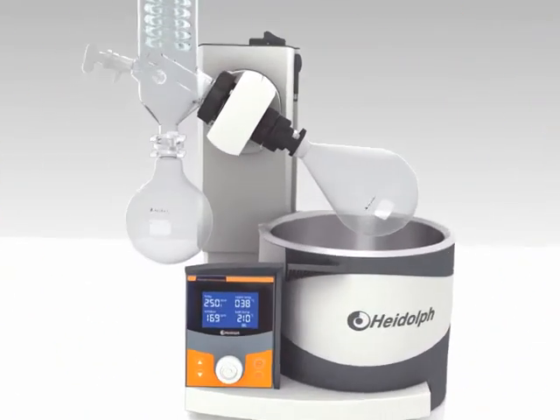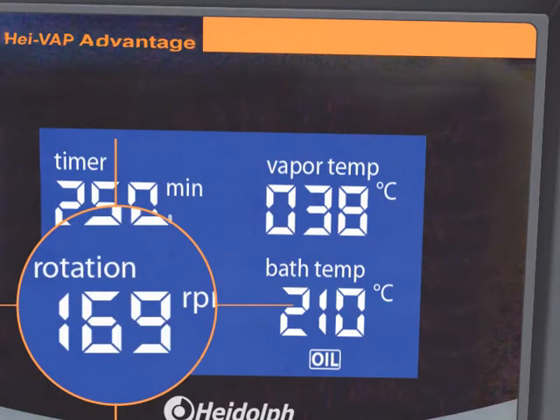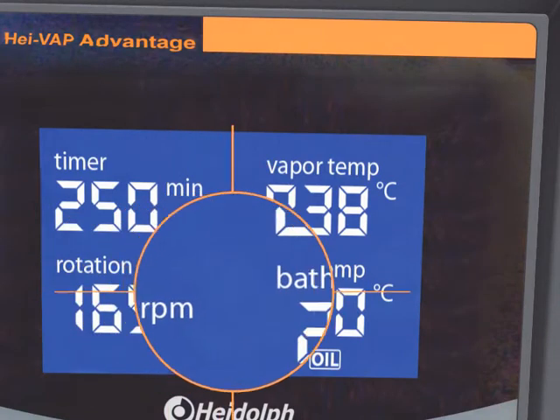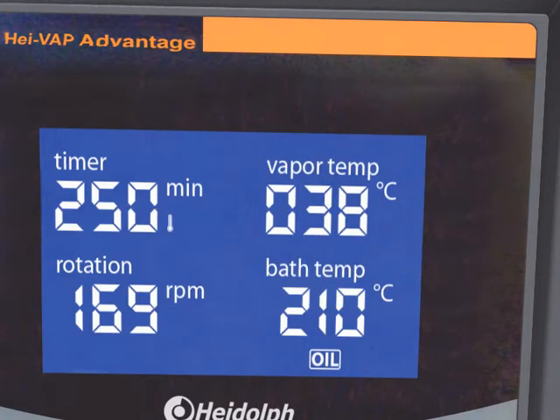Experience the advantages of the large digital 3.5 inch LCD display, which indicates rotation speed, heating bath and vapour temperature. The clarity of this innovative display is simply unique.